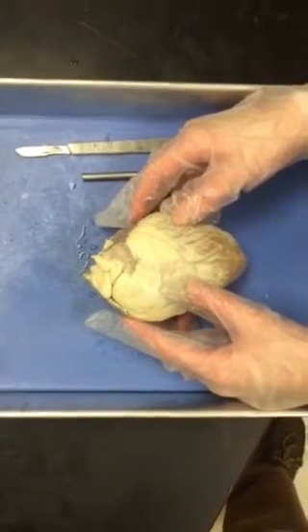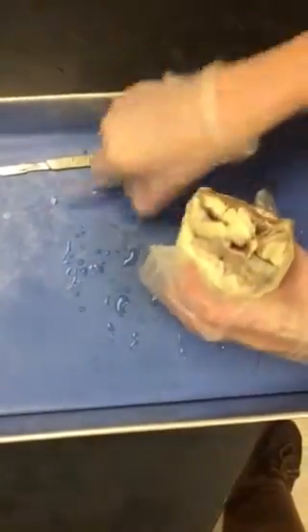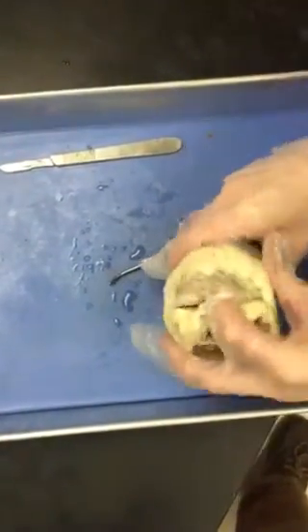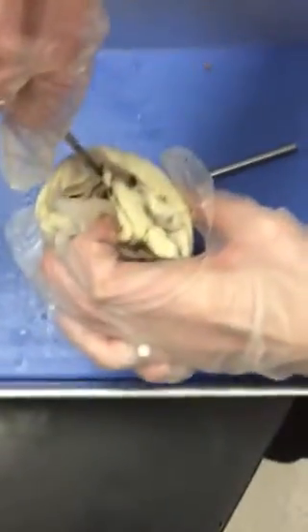25, find the right atrium. 26, use the scalpel to cut through the entire length of the right atrium. Cut through to the cavity, but not through to the other side. This is how we did it.